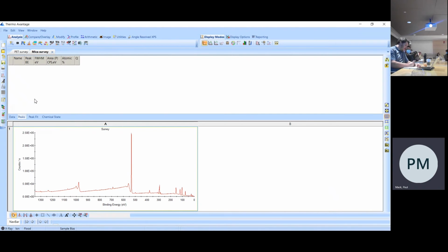or we have another automatic peak routine called ESP. Now this sample doesn't have lithium in it, but ESP can find lithium and ESP can find boron. It works in some respects similarly to what we just saw, but in a big respect, it has a difference. So we'll just see it. So here's our survey spectrum, analysis tab, and we click on ESP.